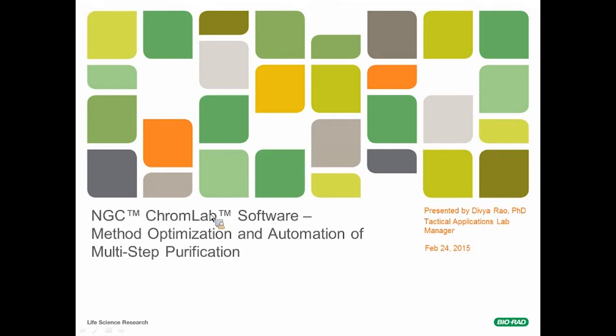ChromLab is a software package that works with the Bio-Rad NGC system to develop, organize, and run chromatography methods as well as collect and analyze resulting data. The ChromLab software is designed to be easy to use and intuitive, and my colleague Benjamin Nickel has previously presented 2 webinars covering the basic features of the ChromLab software and evaluation tools used to analyze run data.